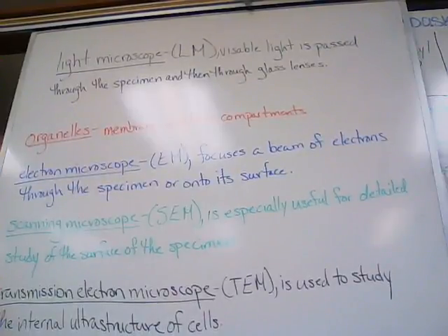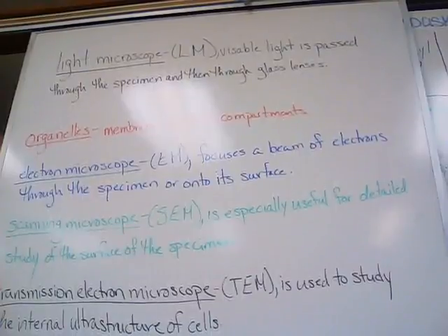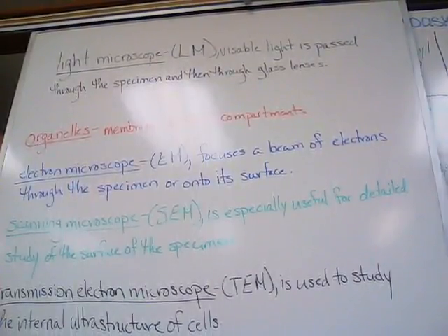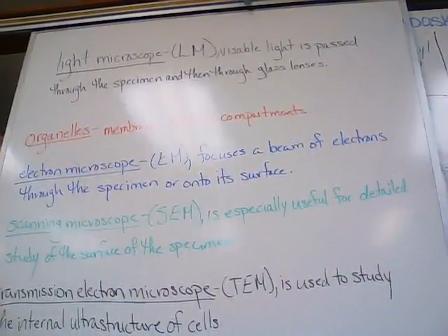A third important parameter in microscopy is contrast, which accentuates differences in parts of the sample. In fact, most improvements in light microscopy in the last 100 years have involved new methods for enhancing contrast, such as staining or labeling cell components to stand out visually.